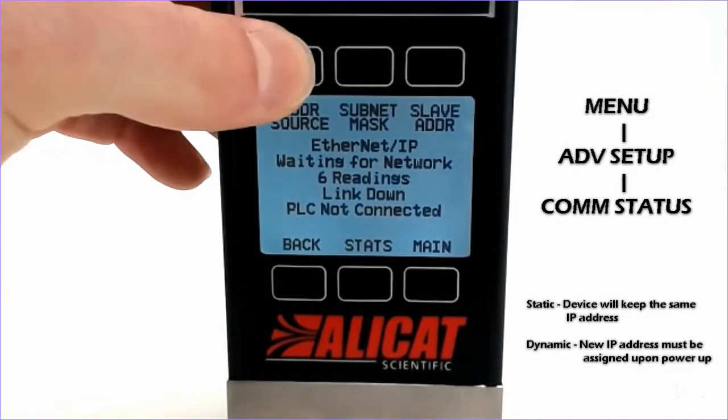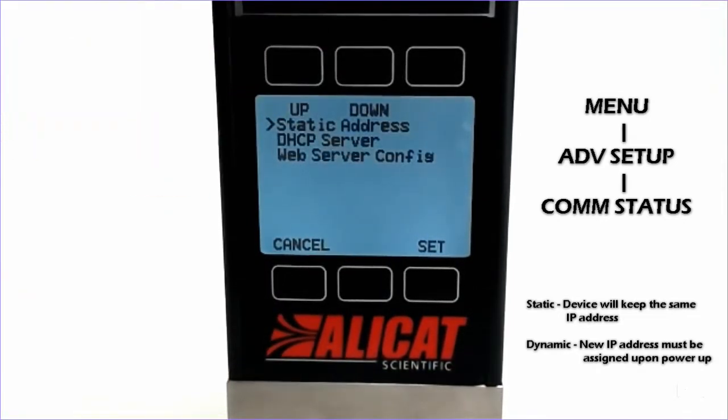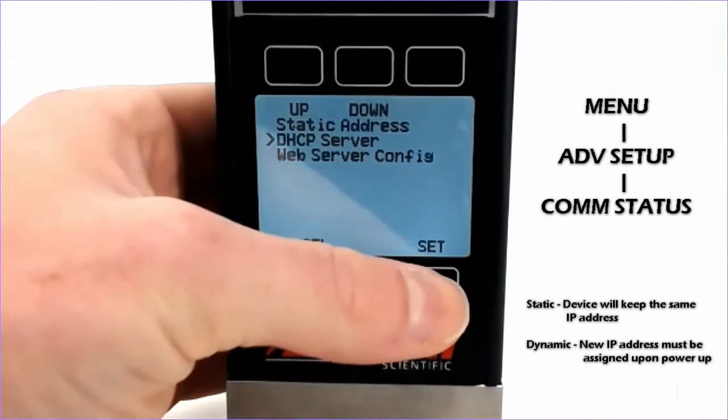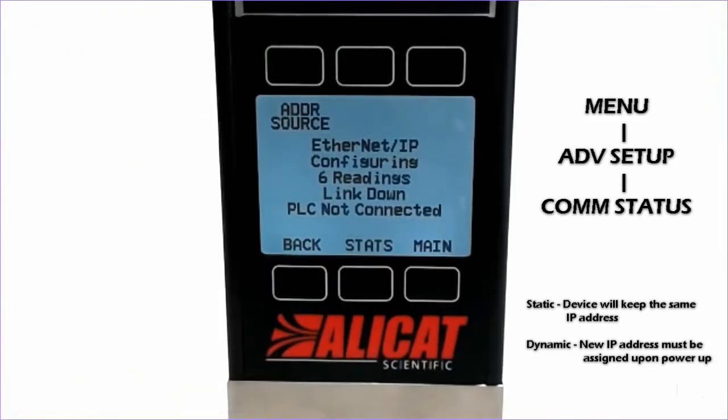Changing the address source to DHCP will allow the device to accept a dynamic IP address using DHCP.